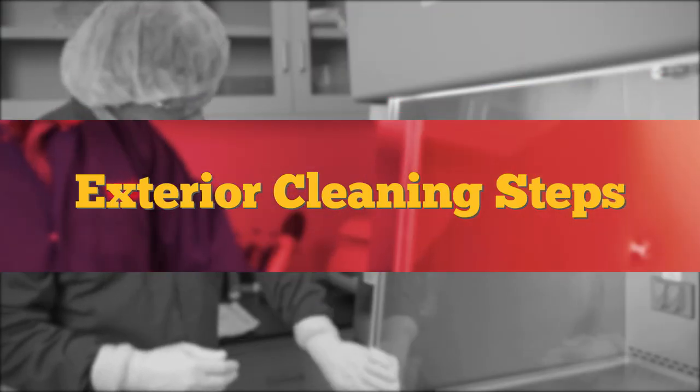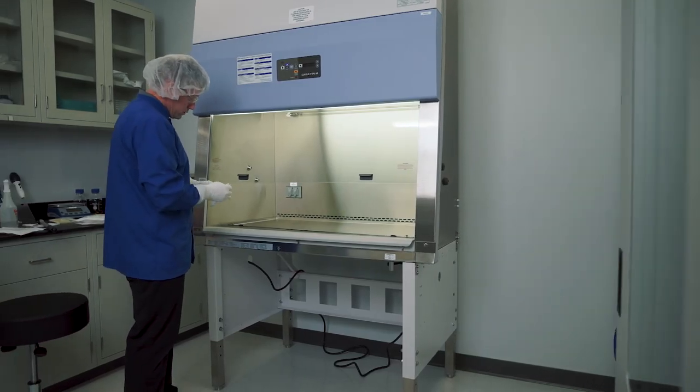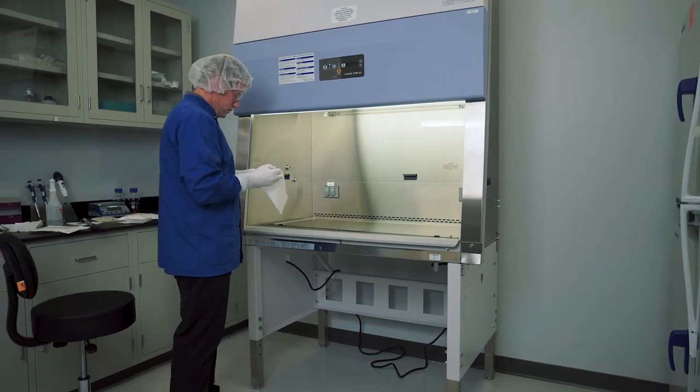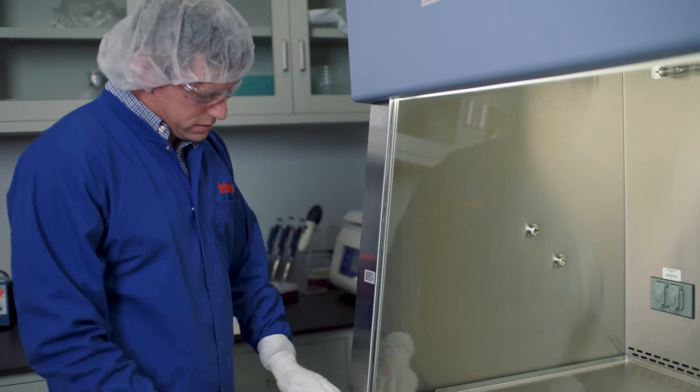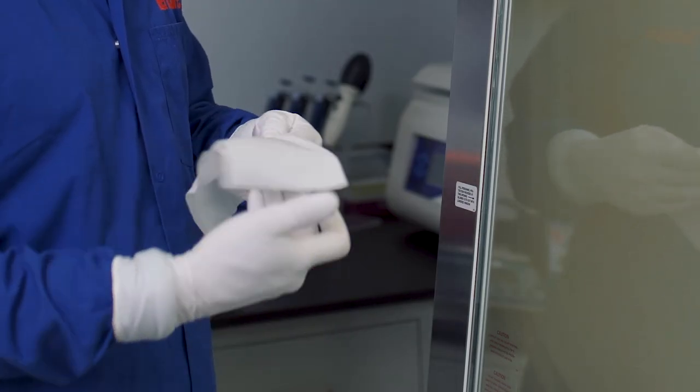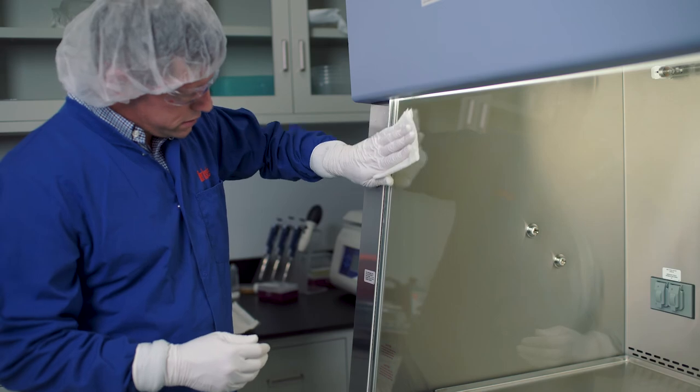Exterior cleaning steps. Use pre-saturated, non-sterile isopropyl alcohol, IPA, and deionized water wipes, starting top to bottom, finishing with the front shield. Remember to quarter-fold the wipe, exposing a clean surface each time.